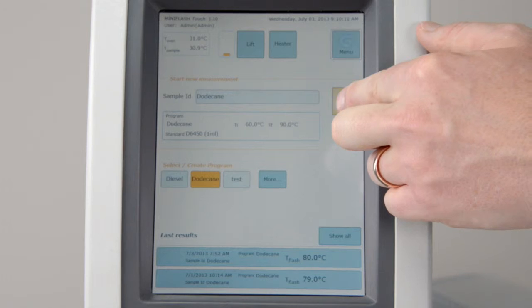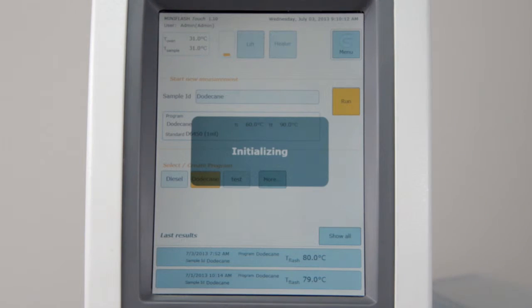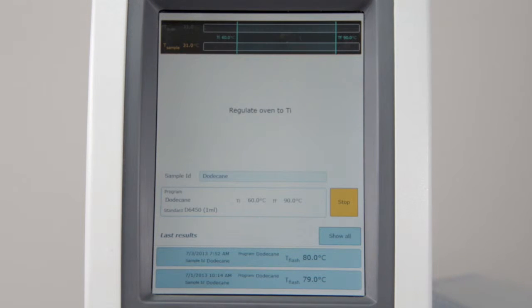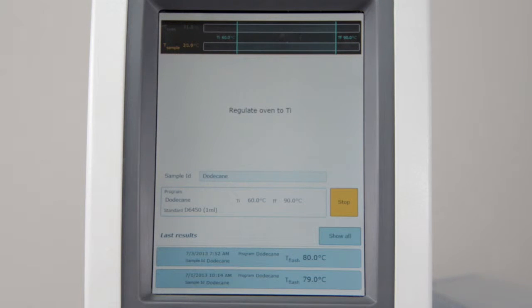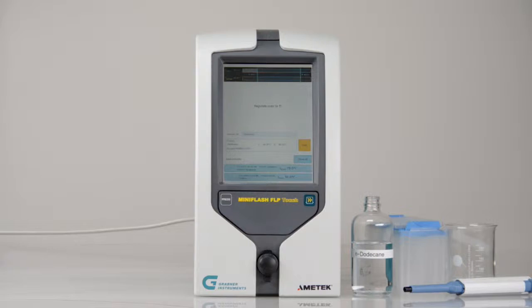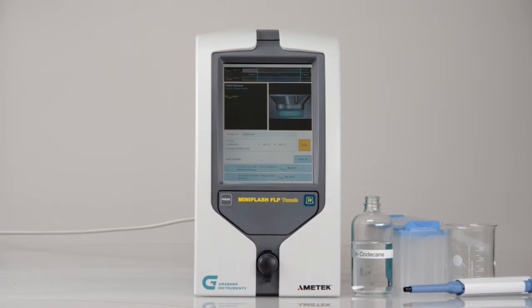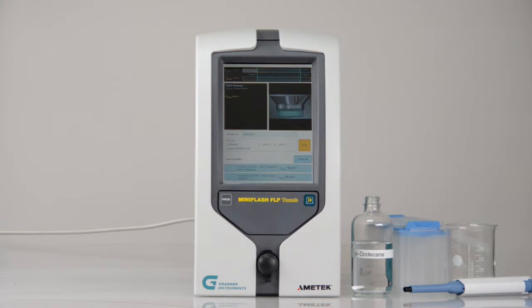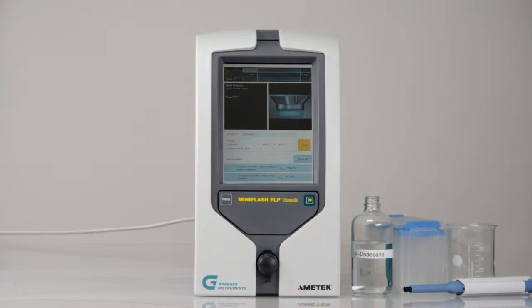Press the run button to start the measurement. In automatic mode, the instrument will regulate to the initial temperature and start the test immediately. You will hear three test ignitions before the sample cup is lifted inside the instrument.